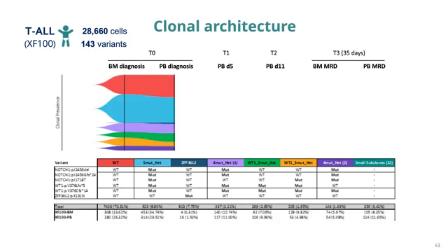And if we check the frequency of these clones, first of all, at diagnosis, we see in red the clone that contains wild-type cells, but then again, we observe a major clone in blue, and this clone is heterozygous for 5 of the variants. Then we also see a collection of minor clones that are present both in bone marrow and blood at similar frequencies. And interestingly, as before, we don't observe clones that are unique either in the bone marrow or in the blood. It's always the same clones.